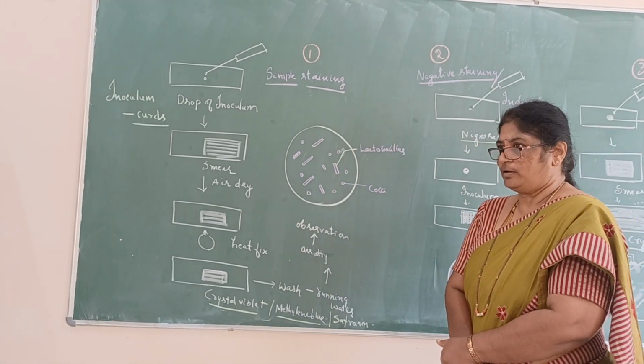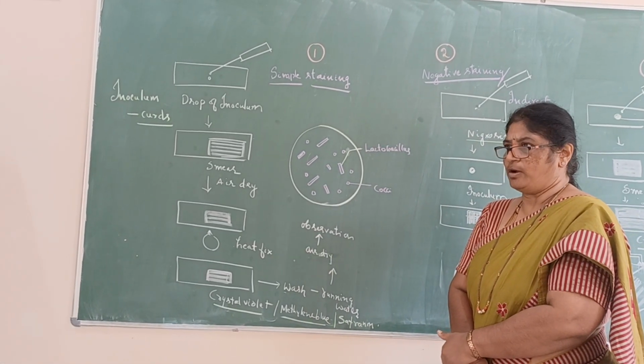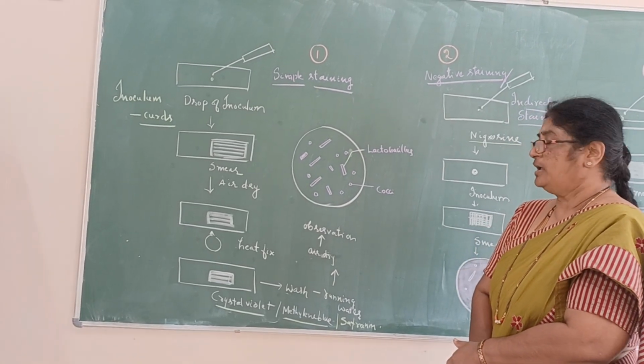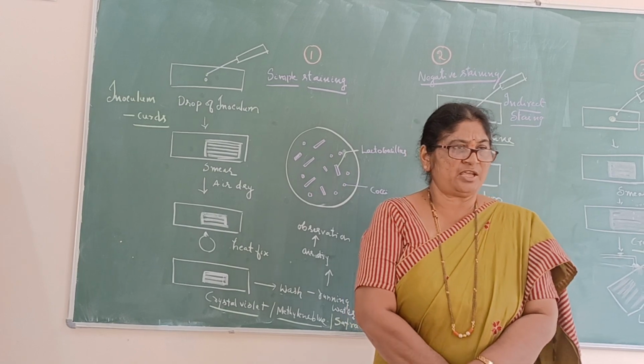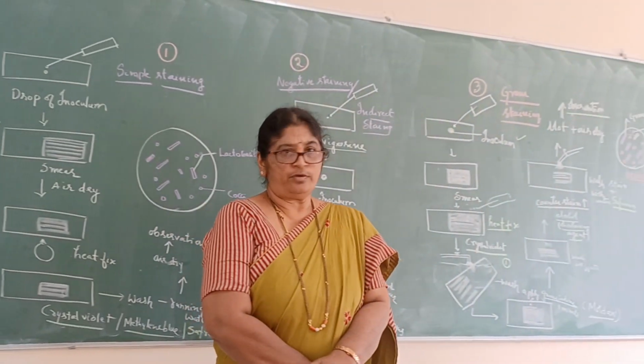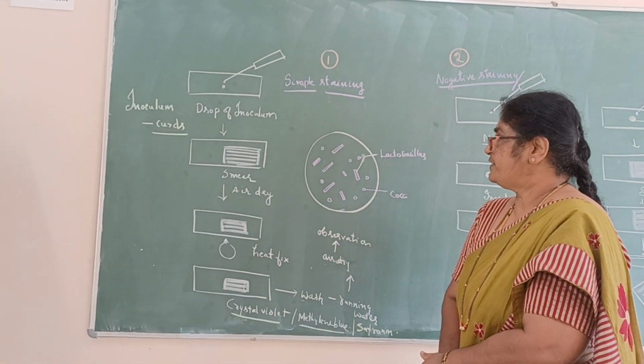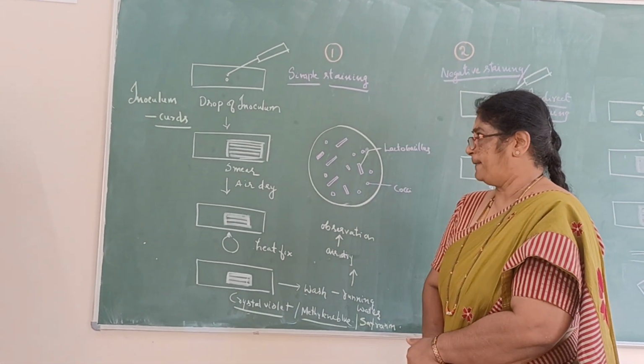Good morning. Today we will discuss different staining techniques: simple staining, negative staining, gram staining, and staining of root nodules in leguminous plants. First, we will discuss simple staining.